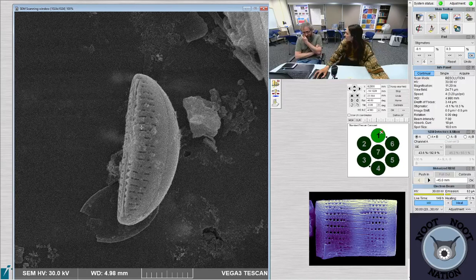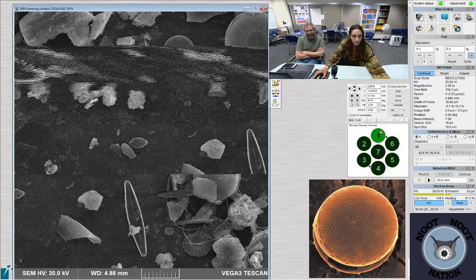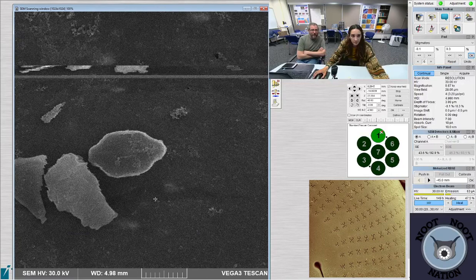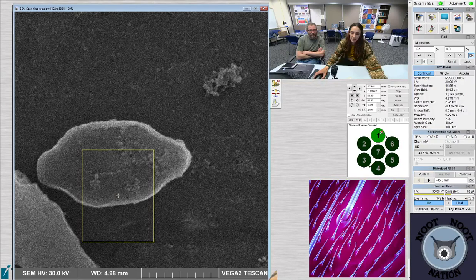A lot of times the bacteria is the same way. It's just like a blob. It's not super interesting. So, yes, but do we want to? Probably not. Also, that would require us to prepare the samples differently. Yes, because if they're soft... We got rid of all the organic matter before we started, so bacteria would dissolve. Yeah, a lot of it would.